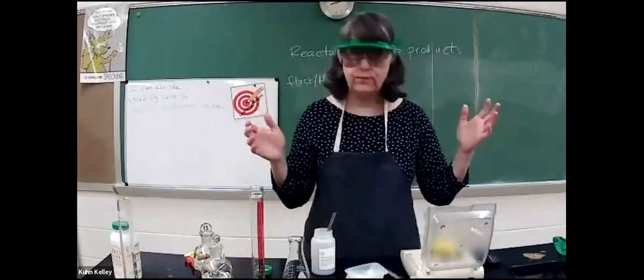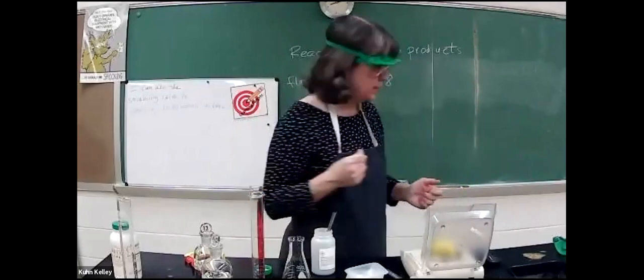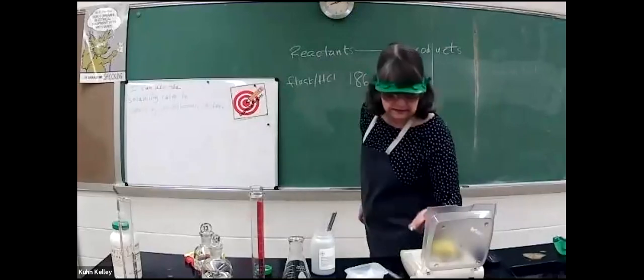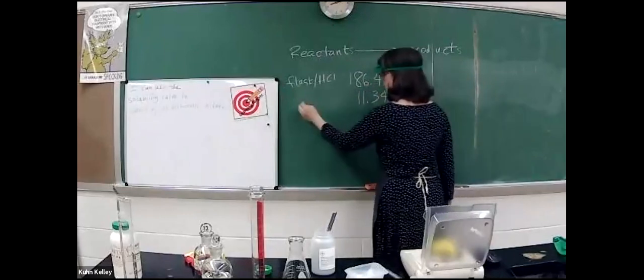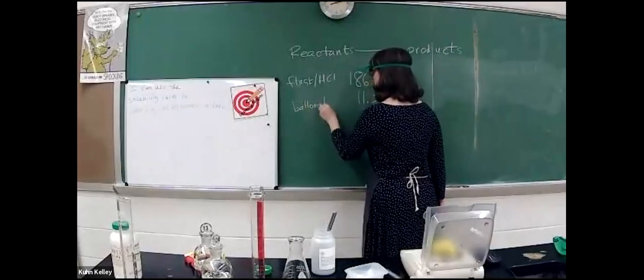And now I'm at 11.34 grams. Remember, I said I wanted to get to around 11 grams. So that's the next thing I want to write down, and you'll need to add that to your data table as well, 11.34 grams. This is the balloon with the zinc.